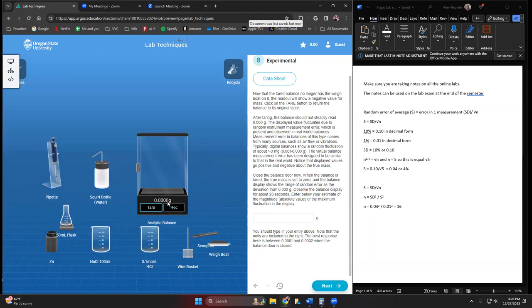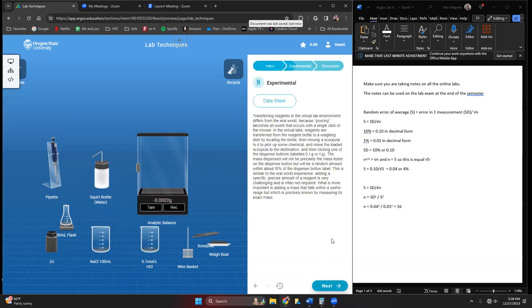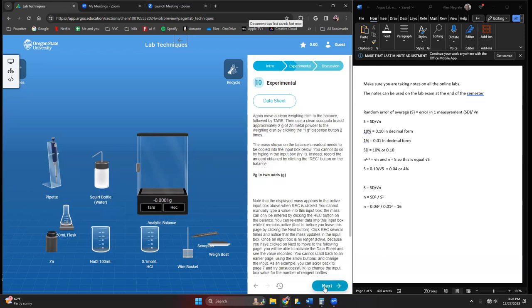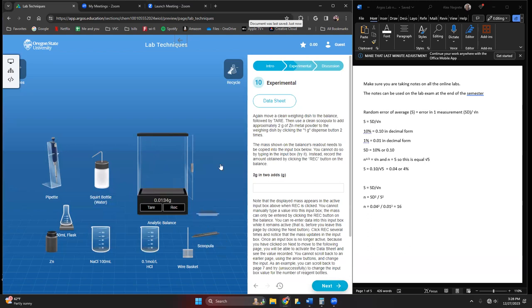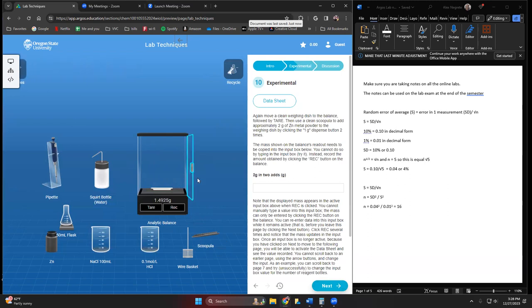We're going to be putting some of this material in here. Let me get rid of this and get a new one over here. There's unlimited supply up there. I need to zero this out, so I'm going to tare it.